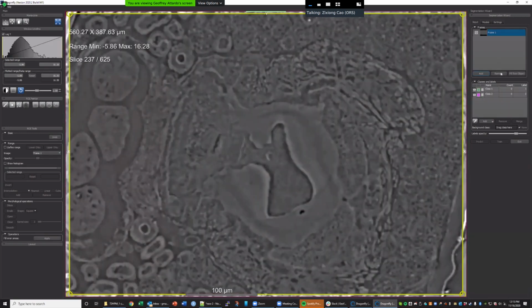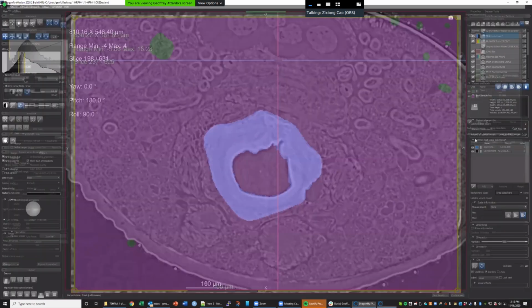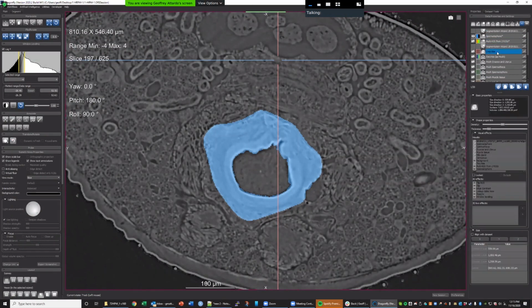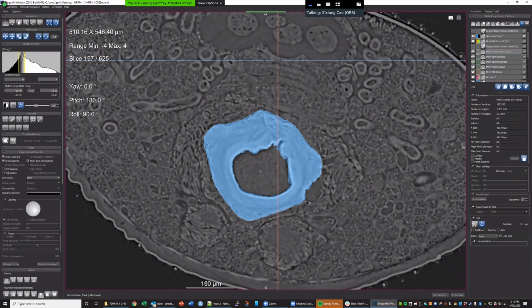Yeah, this is perfect. Oh, you don't see the other multi-ROI. Let me see if this is. No, that's the old one. That's weird. Are you sure you have only one data set? Because the geometry of the data set is important for this. There's this data set. I can shut these off. It looks like you have only one.